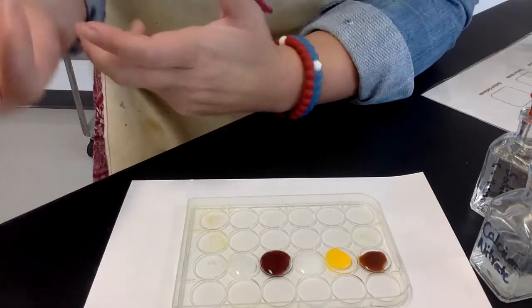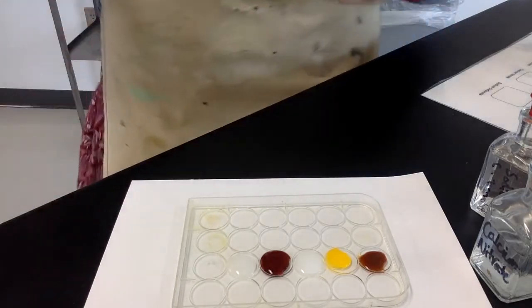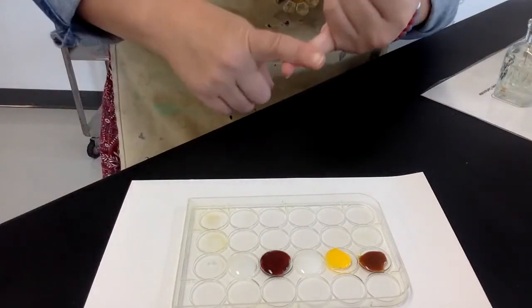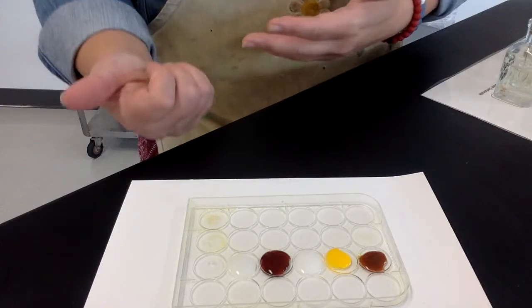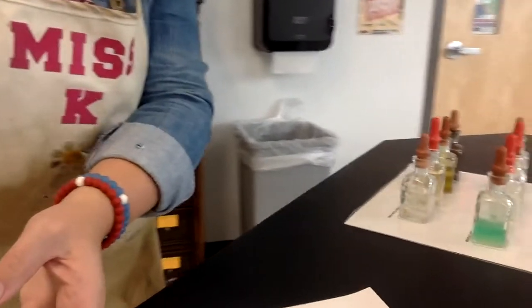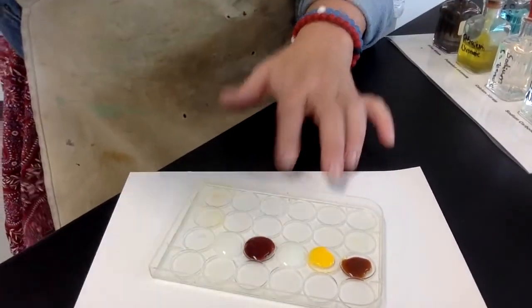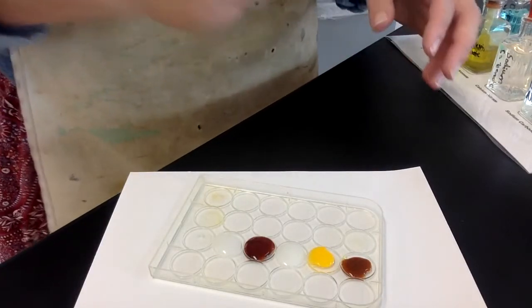And the point of this was to see what kinds of precipitates can form. So here's 5 different examples. Now that you've seen them, you're going to be writing their formulas, deciding which one is the precipitate and which one is not. So you're reviewing precipitate, soluble, insoluble, writing formulas, chemical changes, homogeneous mixture versus heterogeneous mixture. They all start as homogeneous mixtures, and then depending on what you mix together, some of them make heterogeneous mixtures when they make that precipitate. So those are all the different kinds of things that we reviewed.